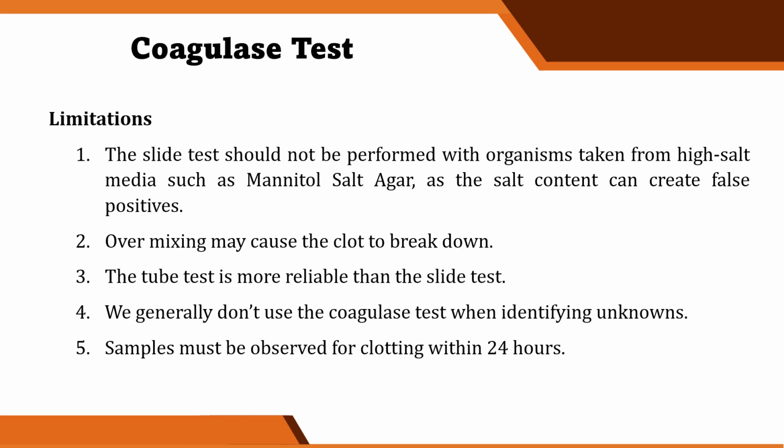Ayun. Kaya natin siya ino-observe for every 30 minutes for the first 4 hours and then further i-incubate pa natin siya, pwede rin natin siyang i-check from time to time. Hindi lang isang beses, hindi lang sa 24-hour or sa 18-hour mark. Okay?